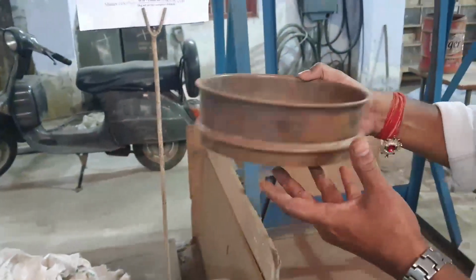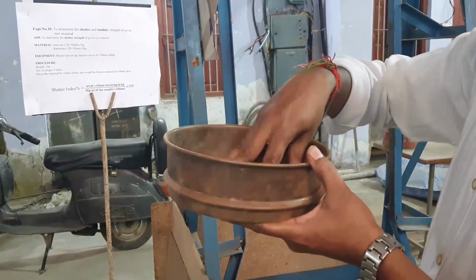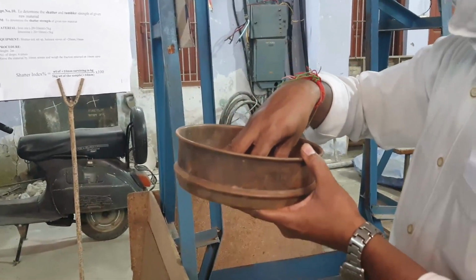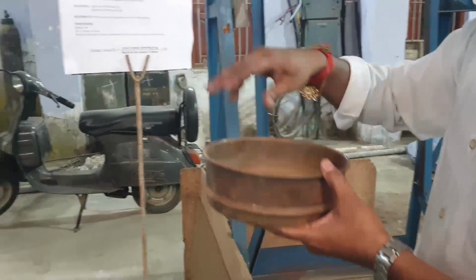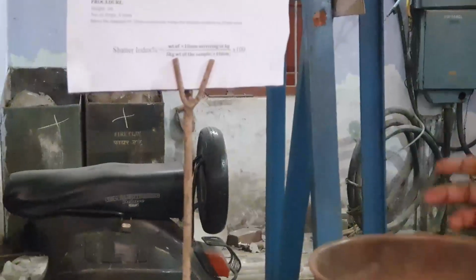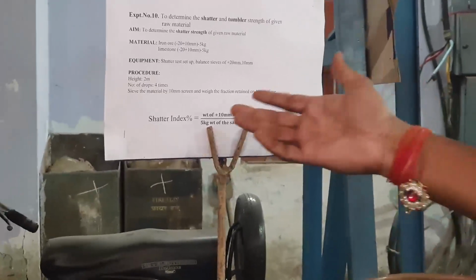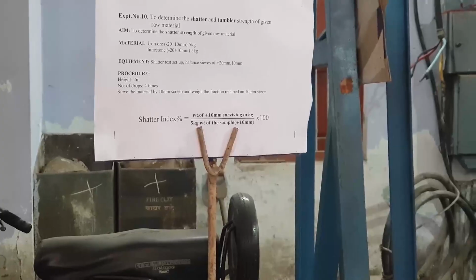So we will screen it. Whatever the material retained above the screen, that is plus 10 mm, that weight fraction we will take. That will be the numerator. Denominator will be the total initial weight. How much are we taking? 5 kg material we are taking. Multiplying by 100, it will give the percentage of shatter index.